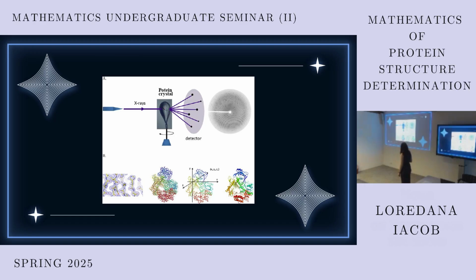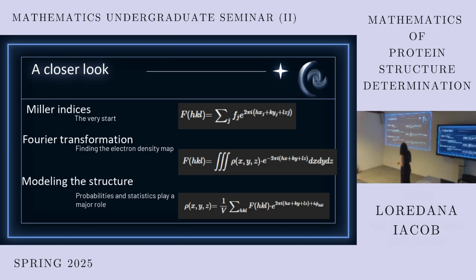This is the electron density map that shows how the electrons spread in that volume of space. And this is basically how the protein is folded and where every atom is with its own electrons. So the electron density map is obtained by looking at the frequencies, which are obtained from the Fourier transform. The frequencies, this one? Yes. Well, that's the frequency of the X-ray to be reflected. Ah, okay.